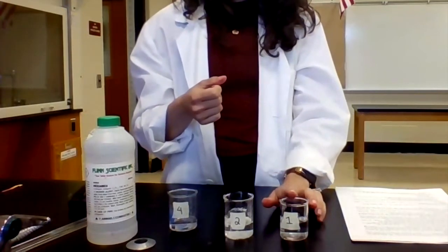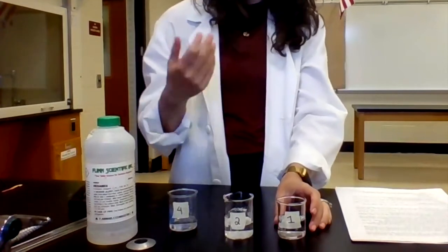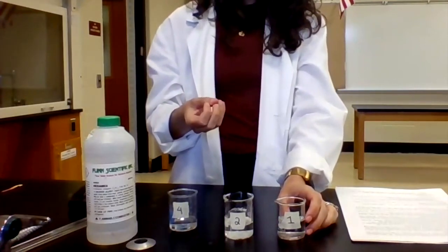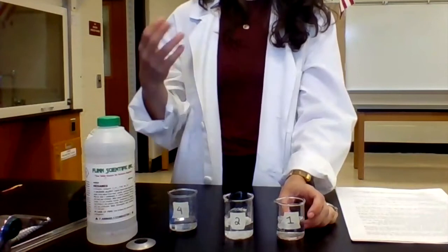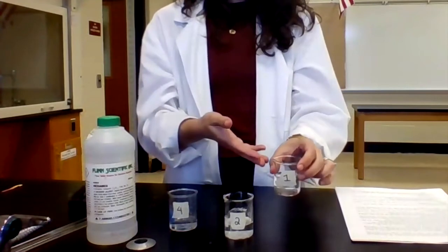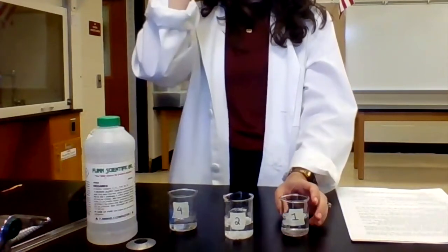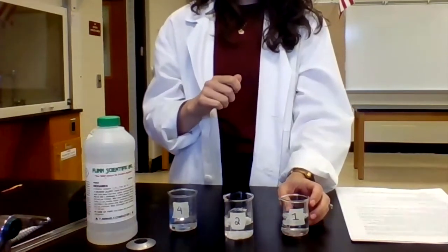So with solid 1 being ionic, it was soluble in water. If it wasn't soluble in water, we would go on and see if it's possibly a carbonate. Carbonates are not terribly soluble in water. And a way we can tell if something is a carbonate is to react it with hydrochloric acid, in which case it would generate CO2 gas. So we would see bubbles form. I don't have to do that here because the solid did dissolve in water. But if you're testing and your solid does not dissolve in water and yet had a high conductivity, you want to see if it's possibly a carbonate by reacting it with hydrochloric acid.